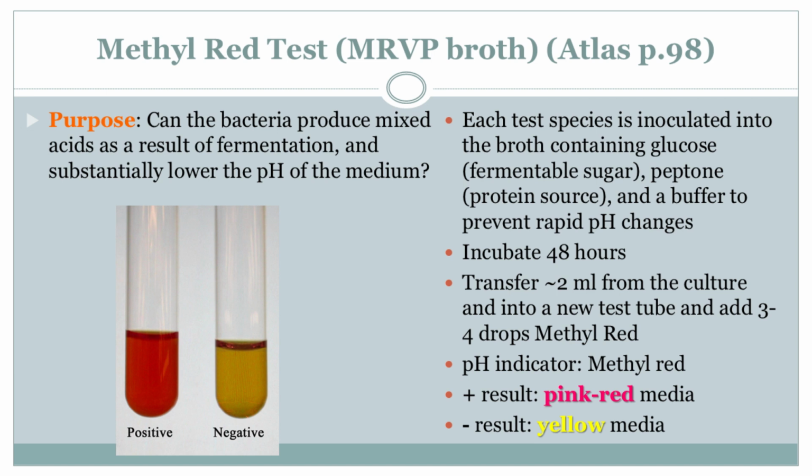So we're not just looking at what they eat, but how they digest, so to speak. Exactly. Can you give me an example? Like, what are some of these bacteria and how do their acid-producing tendencies vary? Sure. Let's talk about Escherichia coli.